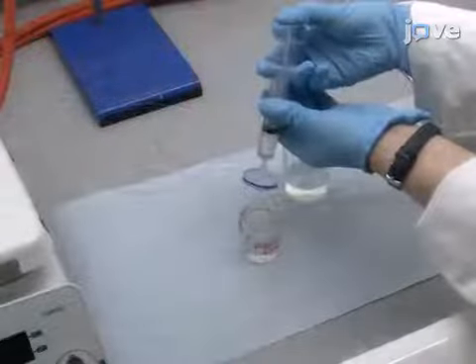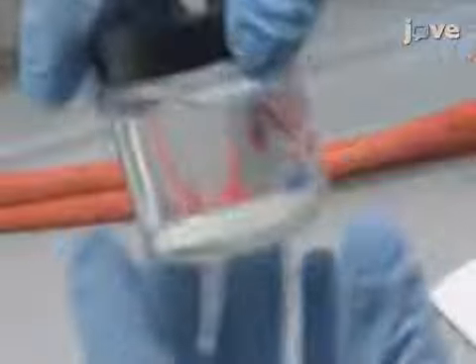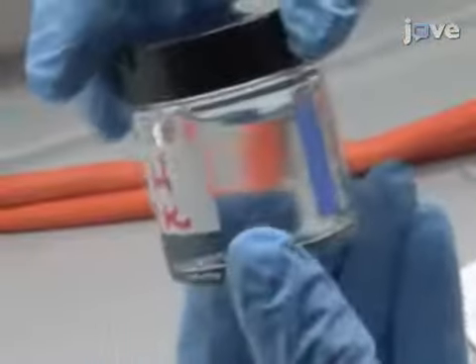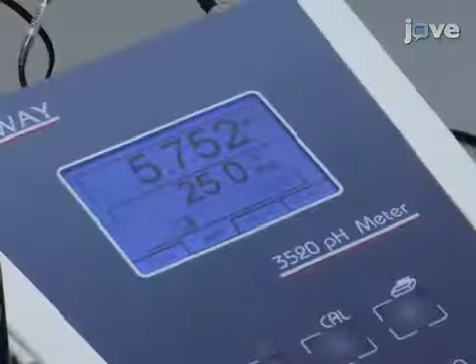After this, filter the solution through a 5-micrometer filter. Visually assess the ink for homogeneity and signs of sedimentation. Characterize the ink as outlined in the text protocol.